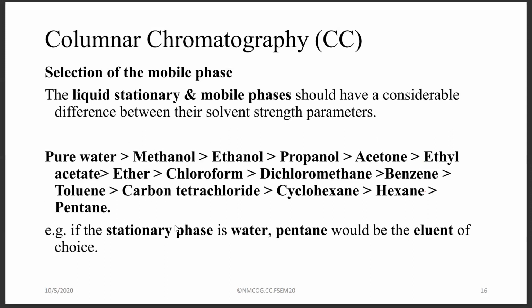So when you're selecting a mobile phase, I think the most important thing is to first understand what we expect from our eluents. We know that pure water is the most polar mobile phase that we can use.